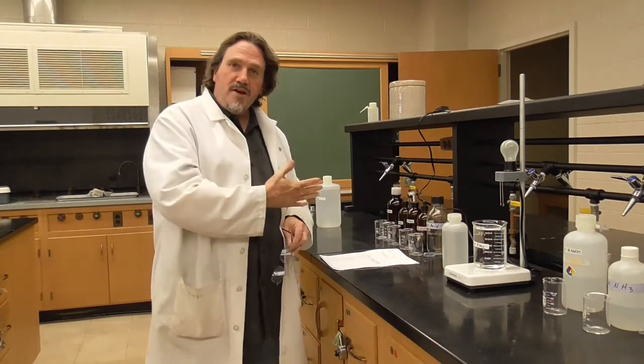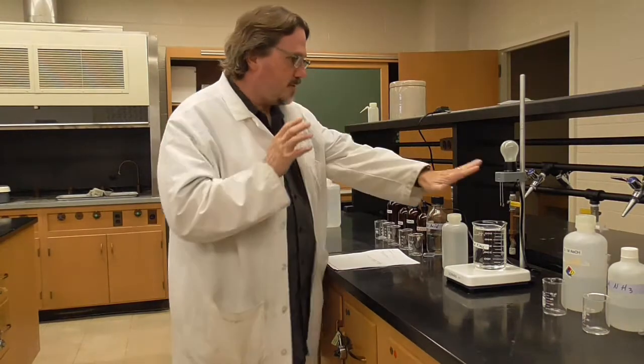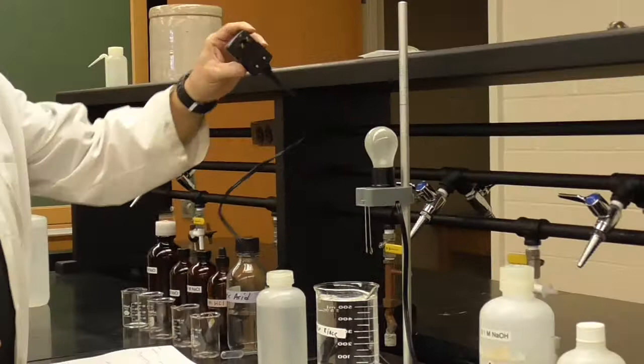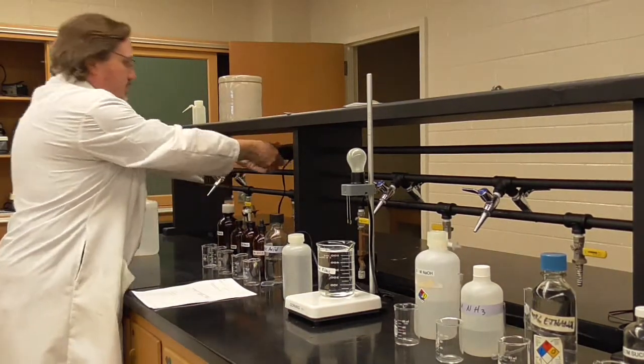We're going to do the same thing here, but instead of a switch, we're going to have different solutions to see if different solutions can connect the wires together to turn that circuit on. So let me demonstrate this for you here. Here's our apparatus to test different solutions. We simply plug it in, normal plug, 120 volts, put it in there.